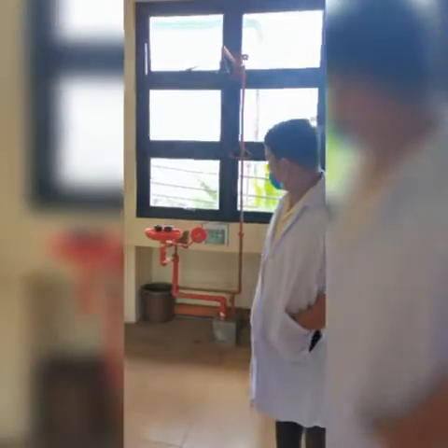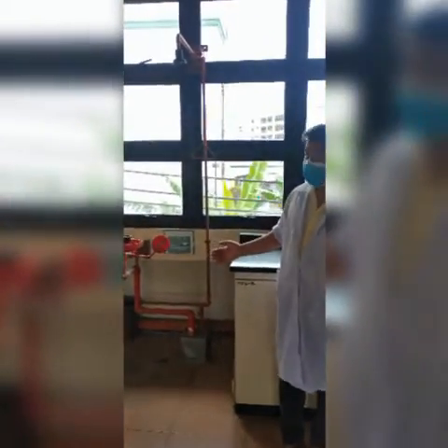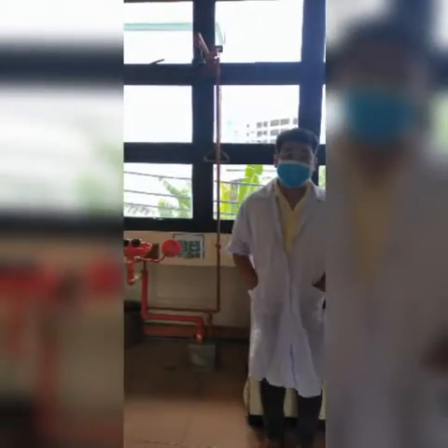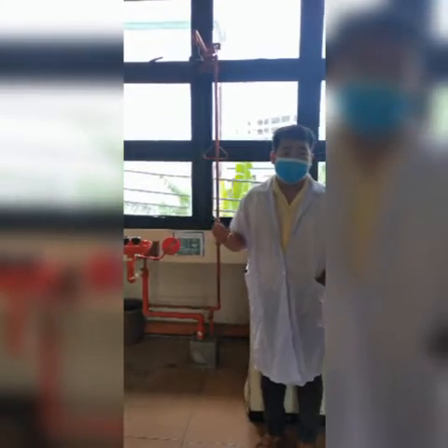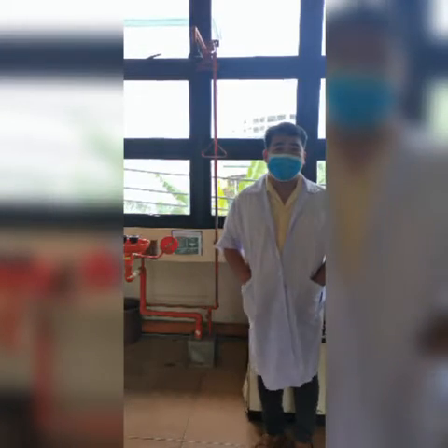This is the wash station or the shower station in case of a burn accident or chemical spill. Students or researchers can wash their body from burns or fires, and use the washing area to wash their eyes from chemical spills.